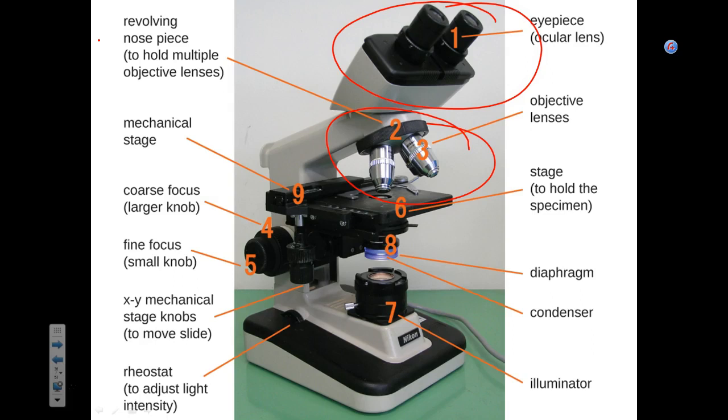When you use oil immersion, when you do microscopy, you go from scanning. I think, did we talk about it? No? Okay. So you have 4 objectives. You have this red labeled scanning. You have the yellow labeled low power magnification objective, the blue labeled high power magnification, and the white labeled oil immersion.